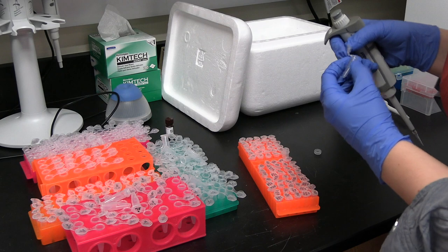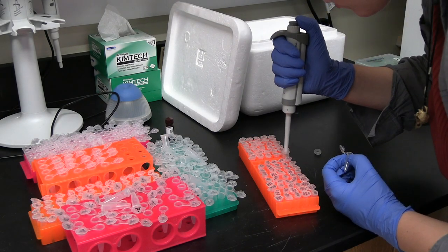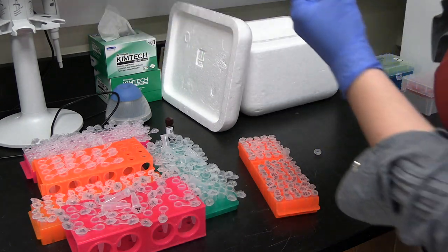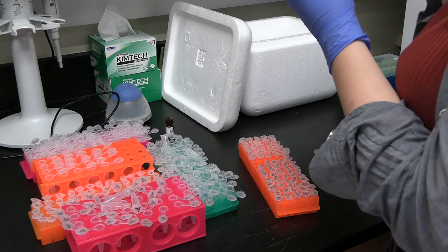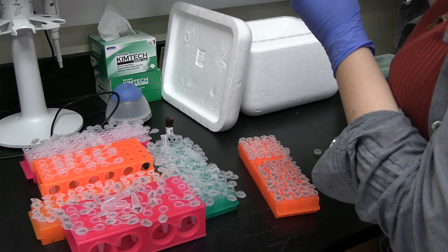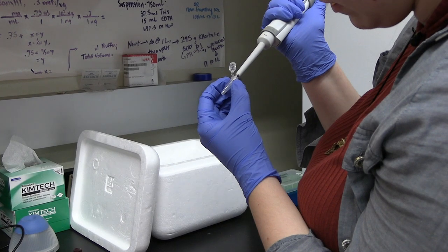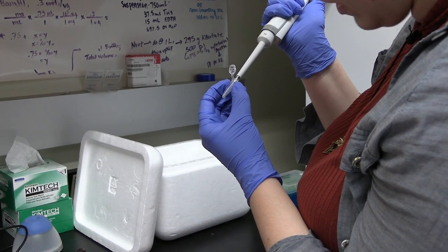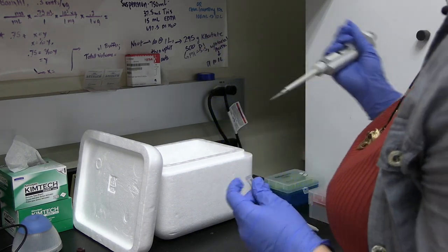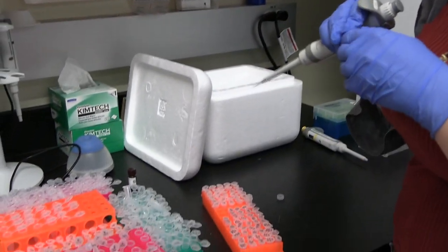Okay, I open my little container. I go into my solution, draw up, make sure it actually drew up, and then this is a fairly small volume to pipette, so you need to be a bit careful. I put my tube about to the end, and then just make sure that as I depress my pipette, all of the solution comes out. And it should look about like that. And throw it on ice. And then just do that 39 more times.